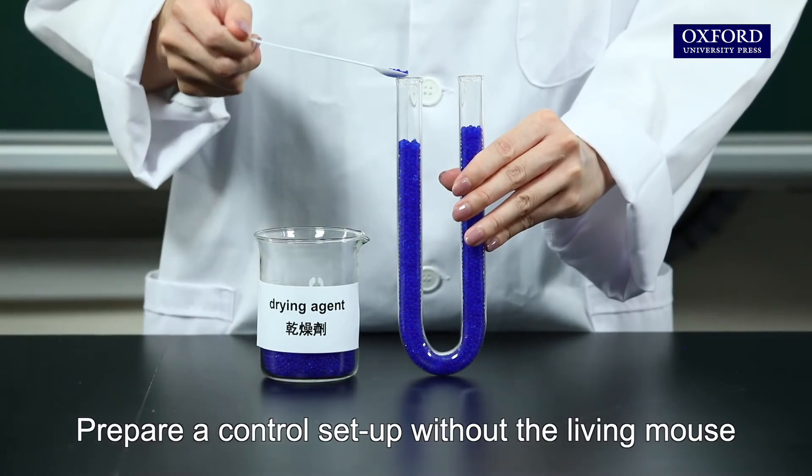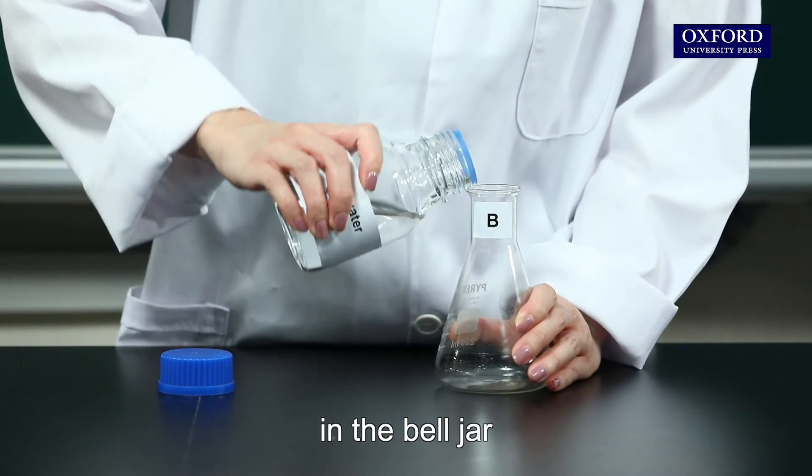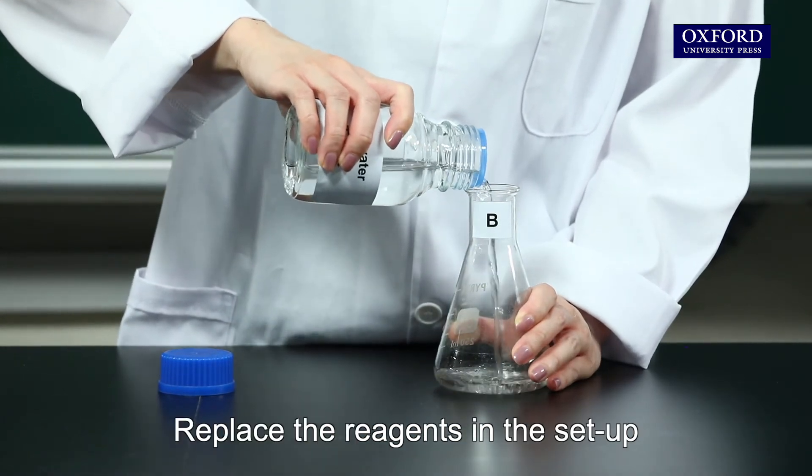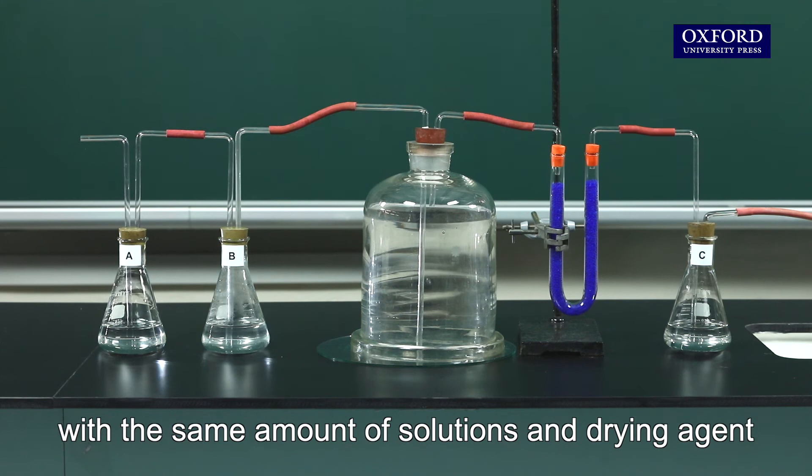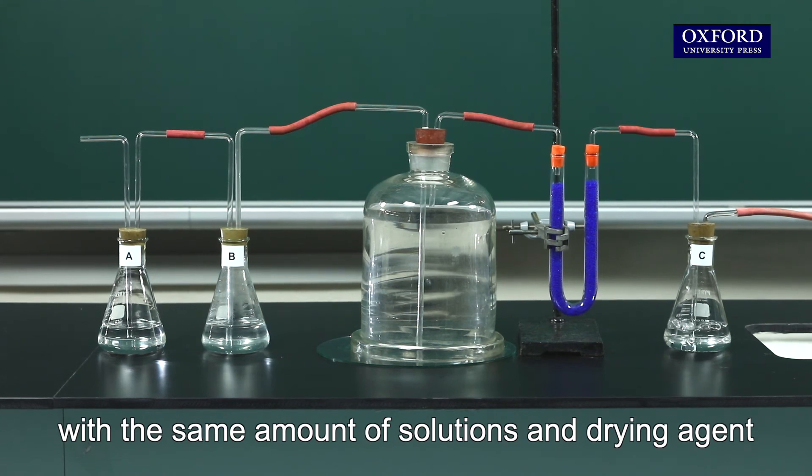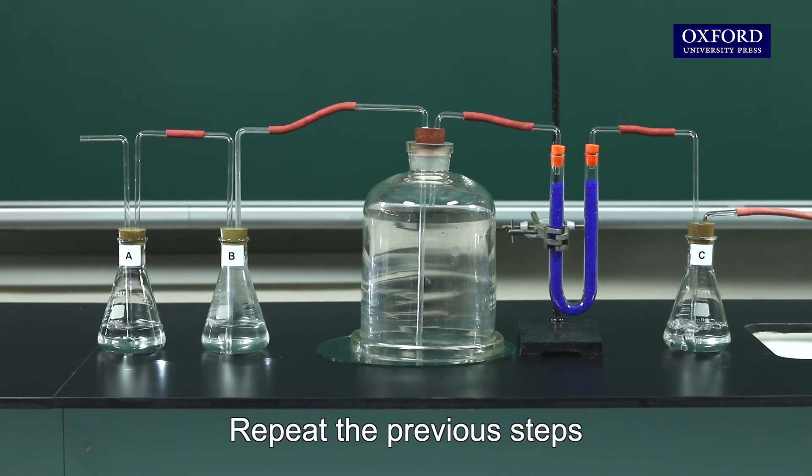Prepare a control setup without the living mouse in the bell jar. Replace the reagents in the setup with the same amount of solutions and drying agent. Repeat the previous steps.